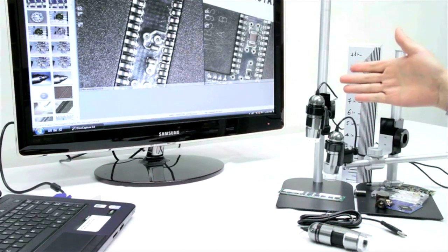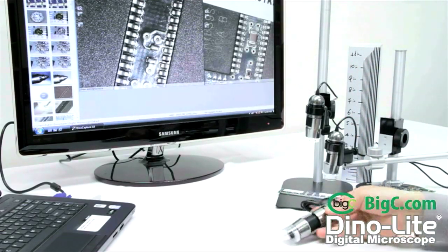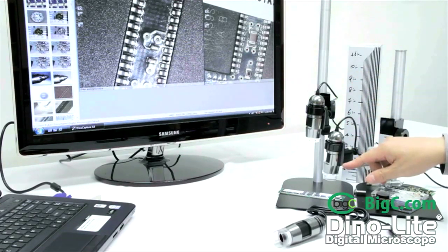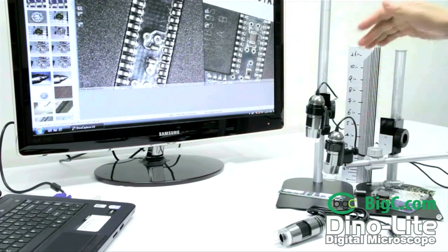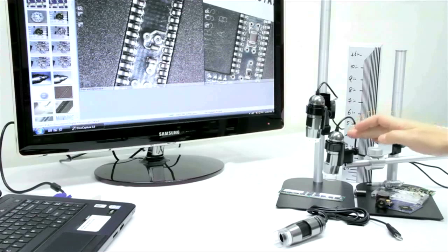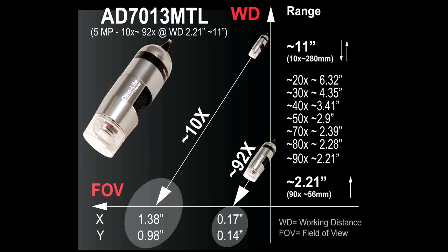To help you find the right microscope for your application, we will review some of the working distances and magnifications. Here we have both of these magnifications set at 30 times. To the left you will see that the L series is about 4.5 inches away. To the right you will see that the ZTS is about 1 to 1.5 inches away.